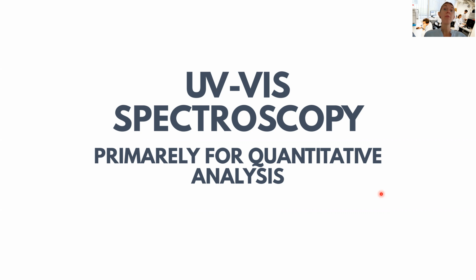So here we deal with absorption spectroscopy. This means that the molecules that we are studying are brought from their ground state to their electronically excited states. And we are primarily focusing on quantitative analysis here. That's for two reasons. First, because ultraviolet visible spectroscopy is used primarily for quantification. So qualitative analysis is simply not so often performed. And there are good reasons that we will find out while looking at the different spectra.